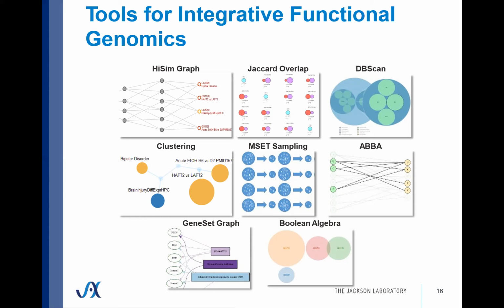But again, the tiers, the data quality scores, the bias scores, proportion of true positives on each gene list, these are all ways that we can improve upon just naively analyzing the sets that are in there. And some of those tools are in production.